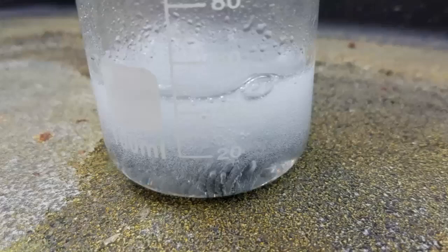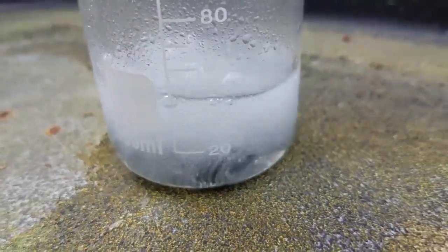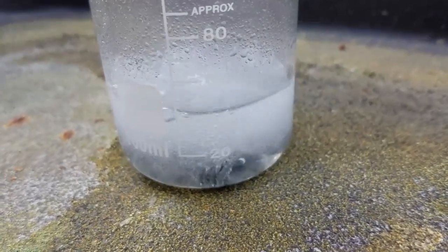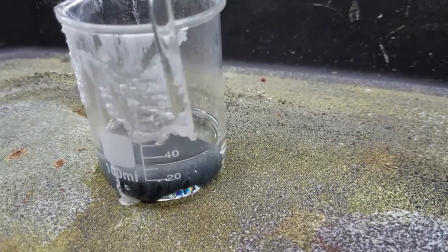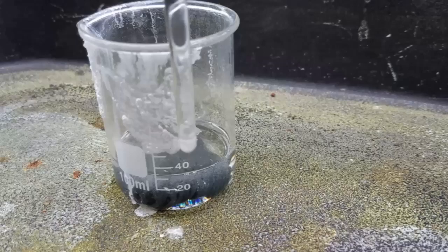Now I will cook the tin in hydrochloric acid for about one and a half hours. After one hour and twenty minutes, my tin chloride is ready.